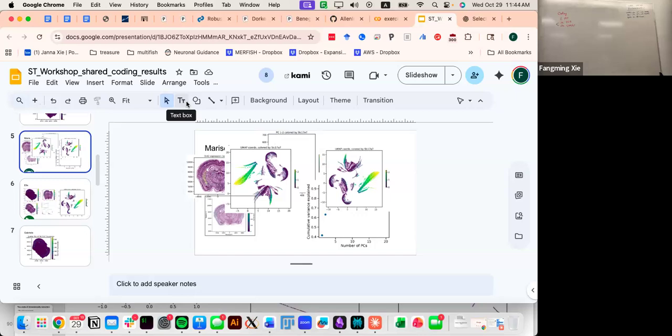If I do this, do I reproduce the error? Looks like it's running. Again, it takes a long time because your feature matrix is too large. Usually what we do is first save your time and just select the first 100 rows. It should run faster.